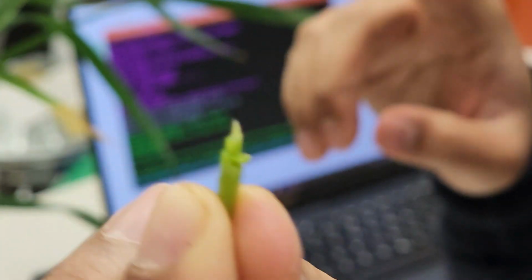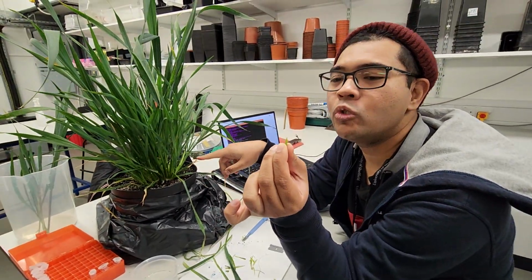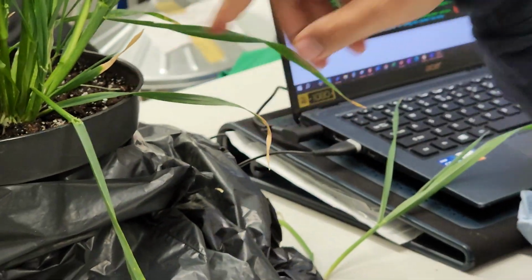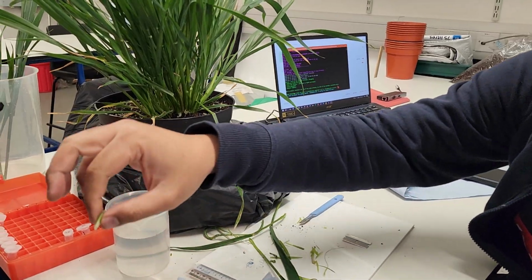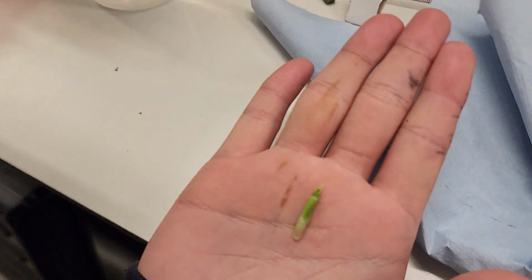So lesson of the day: when you're not familiar with the crop, have something to sacrifice just to be sure. You see that? It's very small. Yep, super small. Can you check with your phone? Super expensive phone, make full use of it. You got a holder now. Careful.